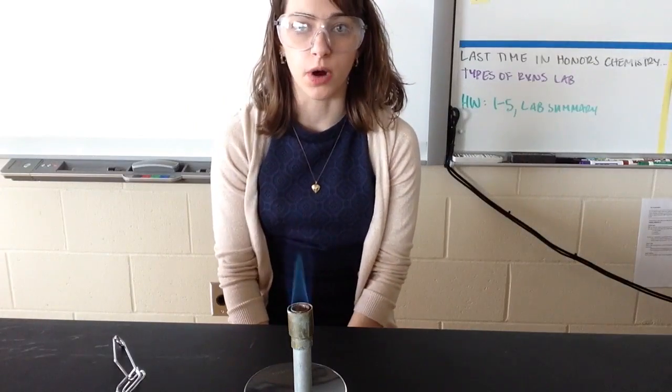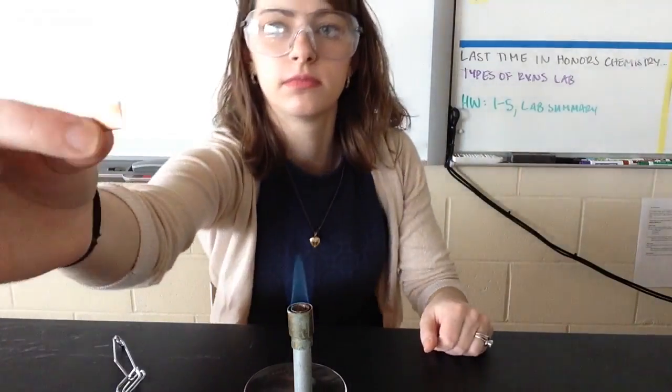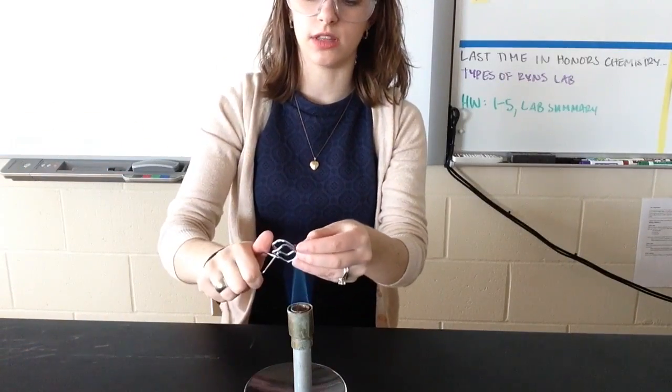In the second part of part one, we're going to be burning a piece of copper. So here's my copper. Then I'm going to hold it in the flame.